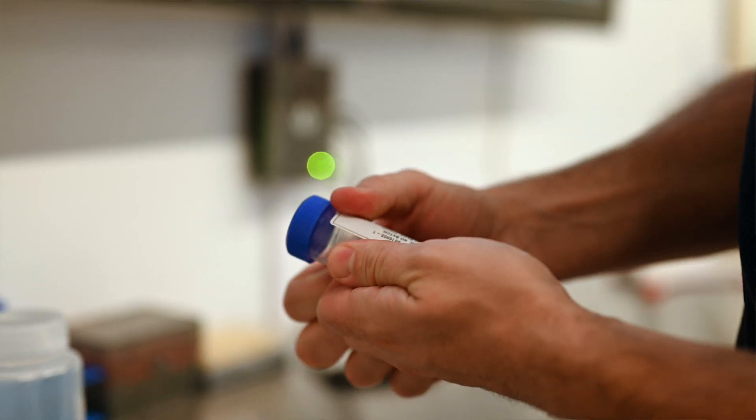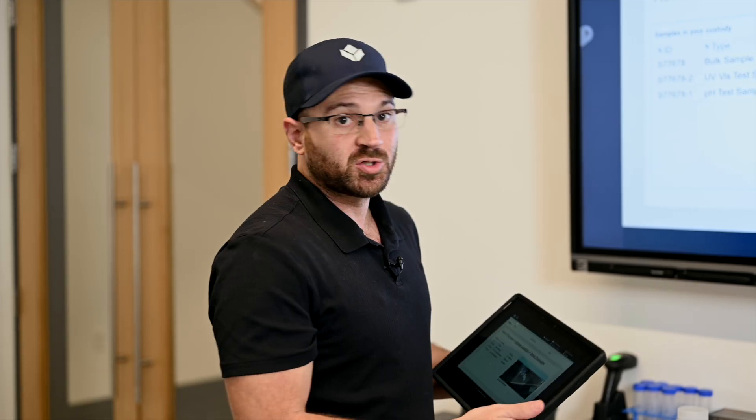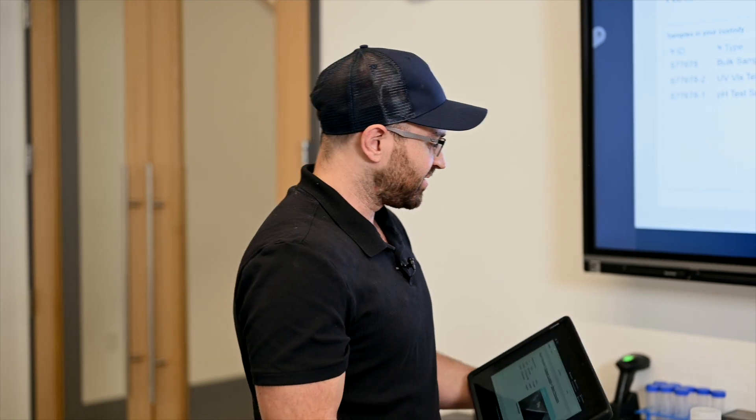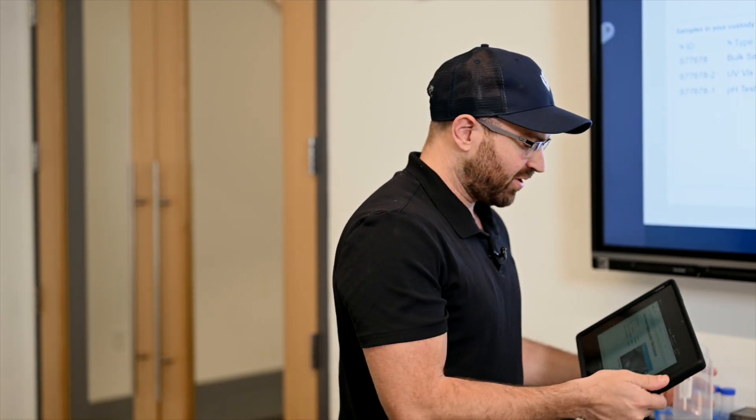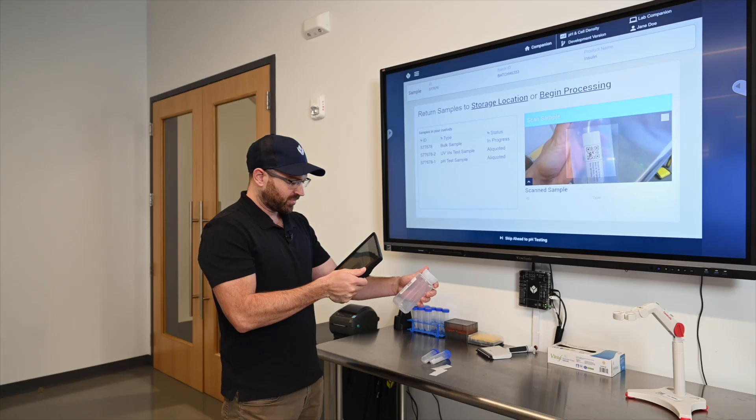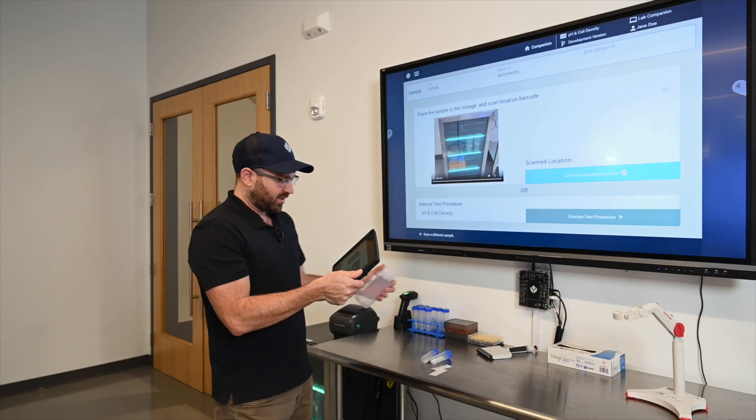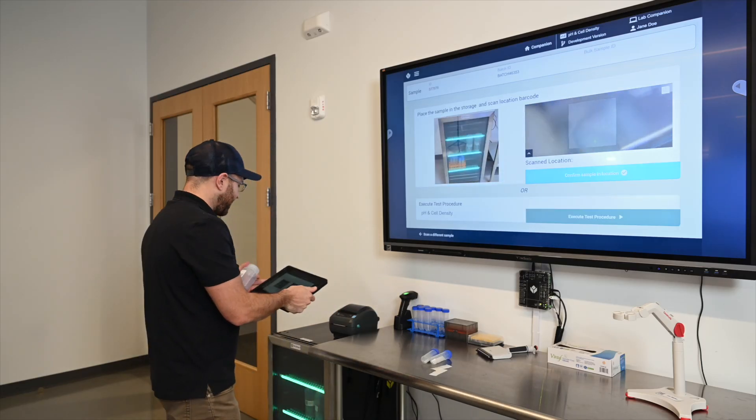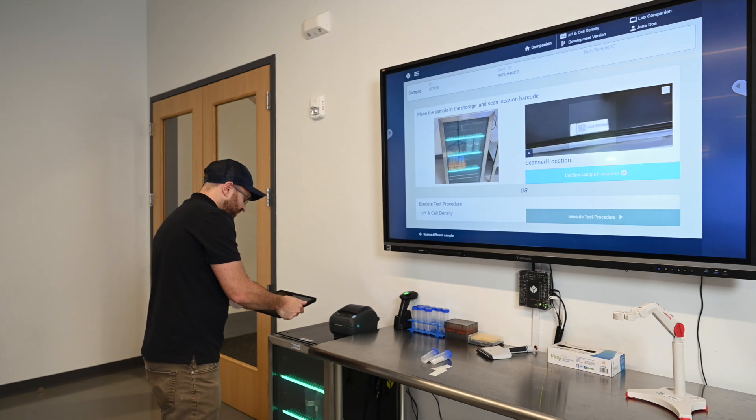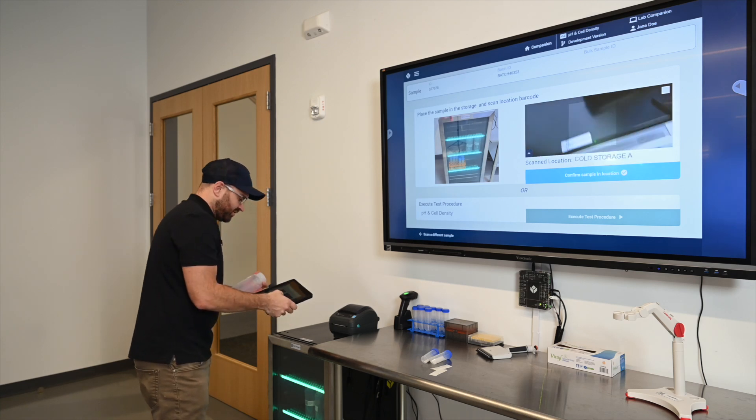And now I have three samples on my table. I need to put them back into storage or begin processing them. I'm going to start by scanning the bulk sample and scan it back into location because it has to remain in storage.